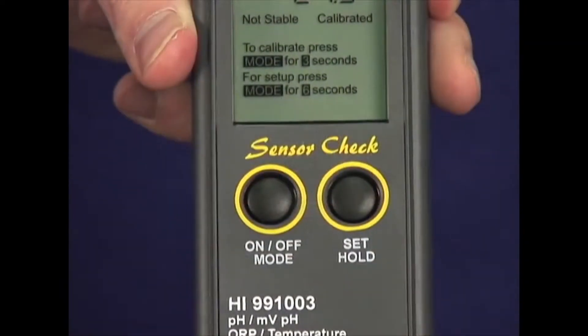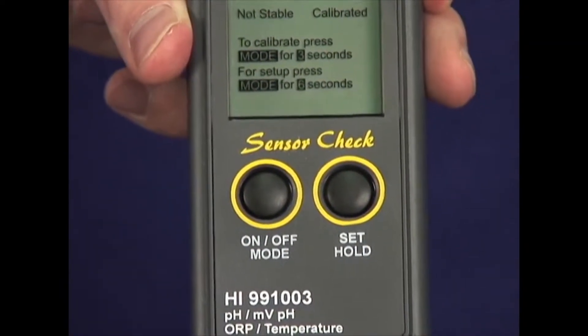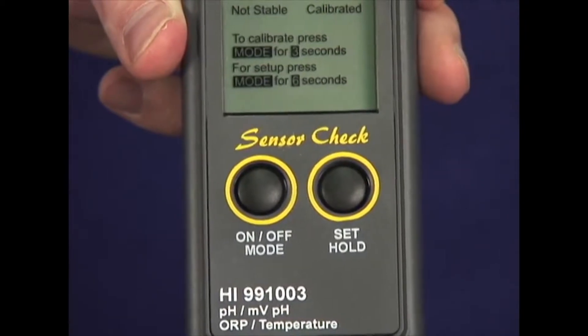The meter comes with two buttons and a unique sensor check feature that allows you to determine your electrode status at any time.